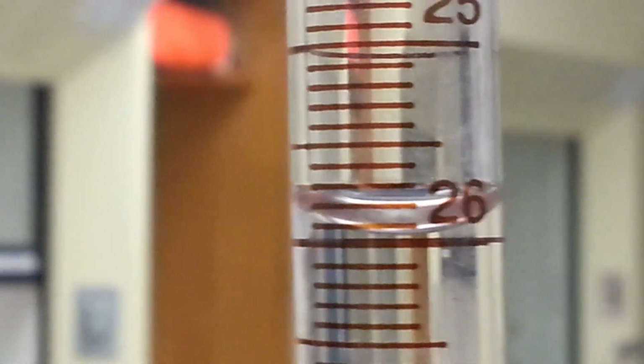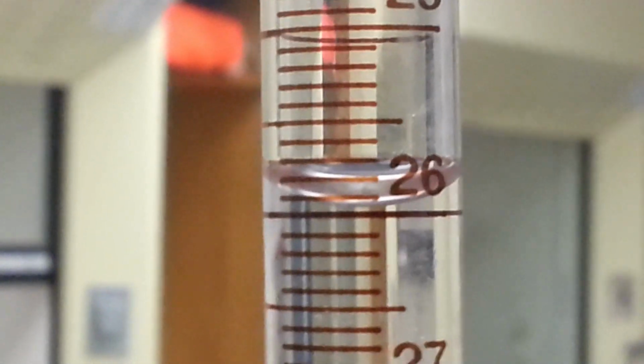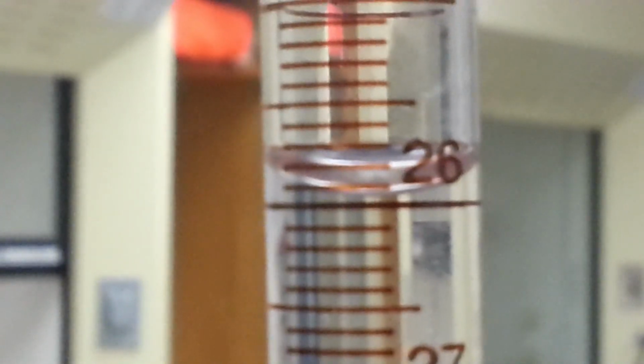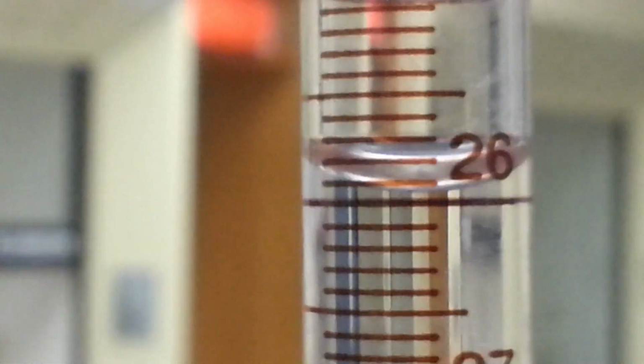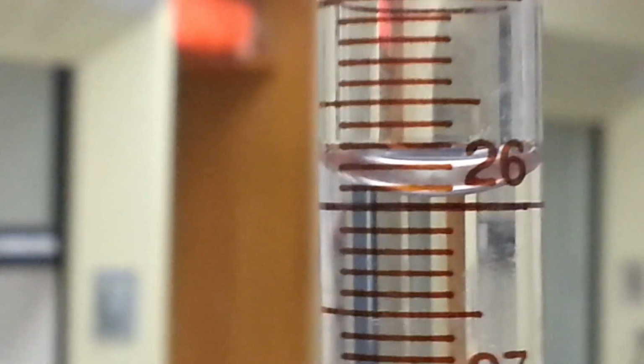We measure the volume again, and we see that for the rough titration, we obtain 25.90. It's a little bit overpassing. 25.90 is okay.